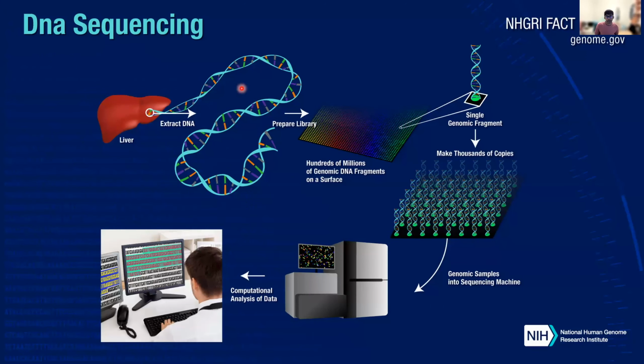The reason is, as I told you, this process will break the DNA strand into pieces from random locations. So what we get through the sequencer is a set of fragments in a random order, and we don't know what the order is. You can think of an analogy like this. Let's say you take a paper, like an A4 paper with some sentence written, and you tear it apart into tiny pieces.